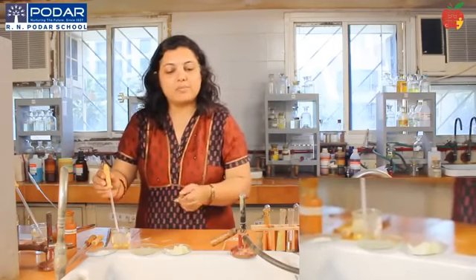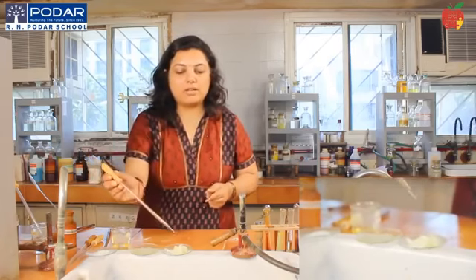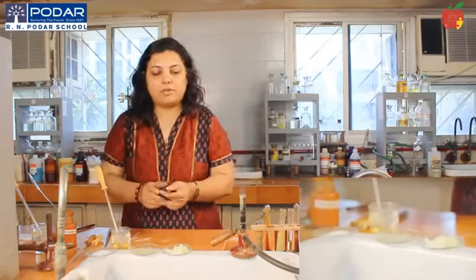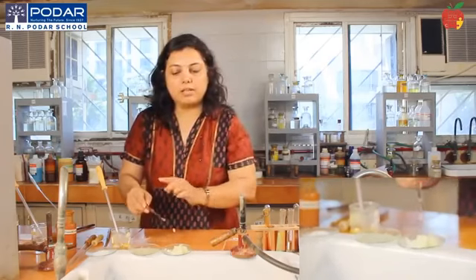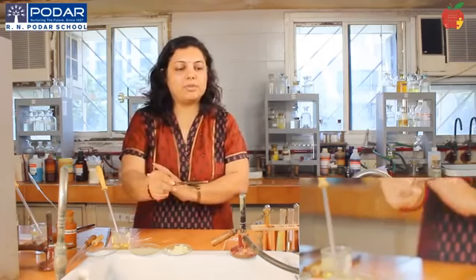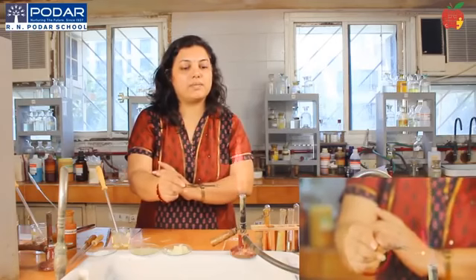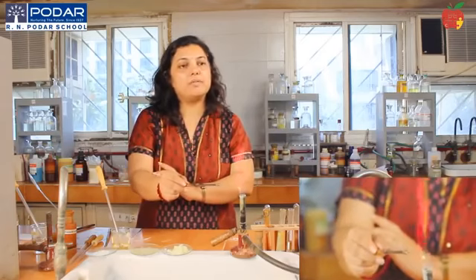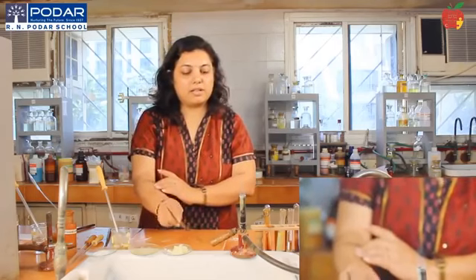Now I have 3 samples. This is your strontium, calcium and barium. To each one of them you will add concentrated HCl, okay, so that a paste is formed. And then you will take a little amount of that paste on a platinum wire. You will make a loop towards the end of the wire and then put it into the flame. Can you see the color now? This is your crimson red. So this is your strontium sample. So with the color which is imparted to the flame you will be able to identify the cation.